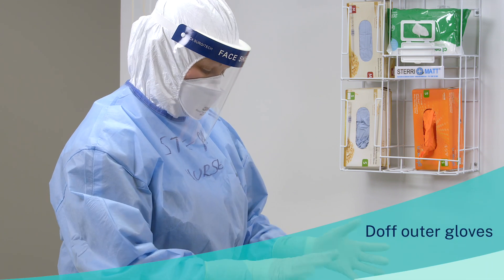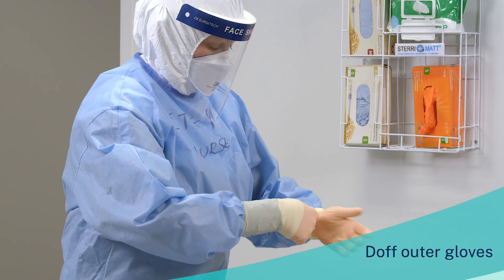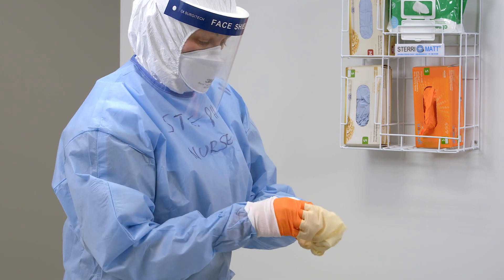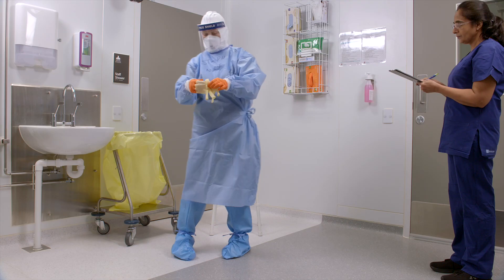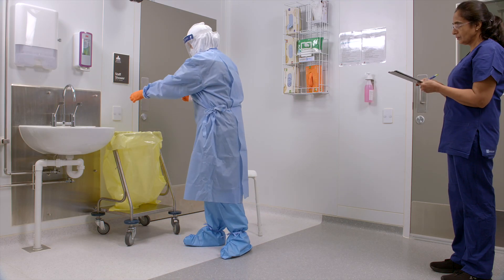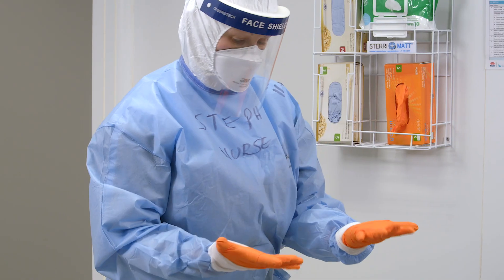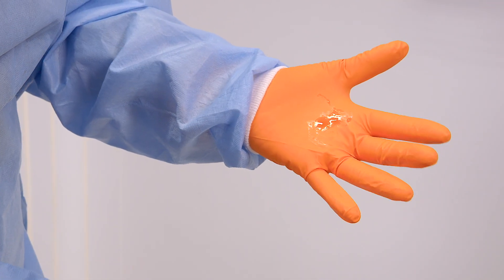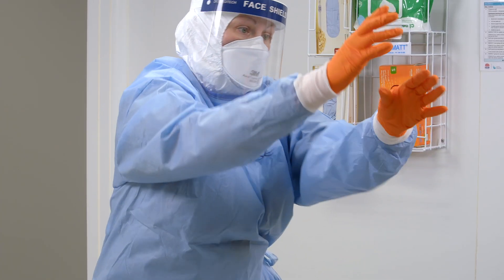First, doff the outer gloves. Take care to pull off gloves without touching the outside to minimise risk of contamination. Once removed, discard into the clinical waste bin. Inspect the inner gloves for any contamination. Remove any visible contamination with disinfectant wipes.